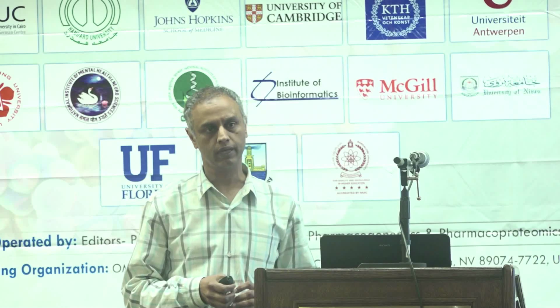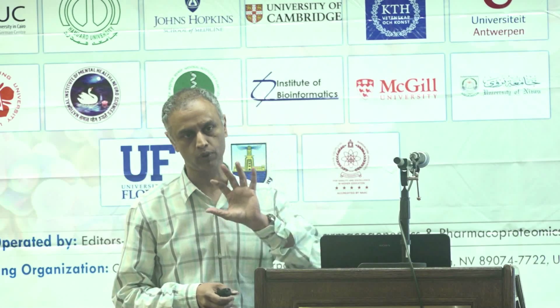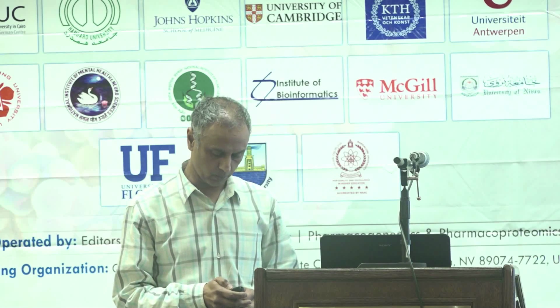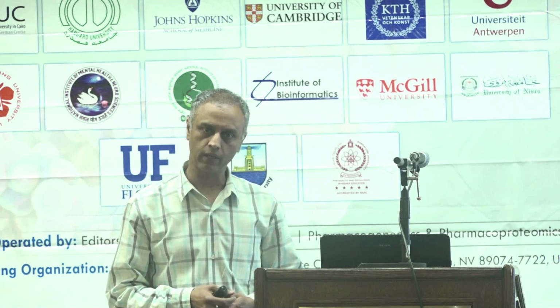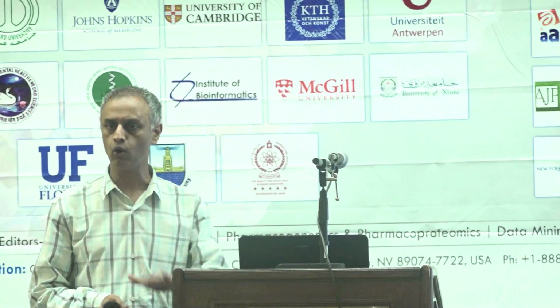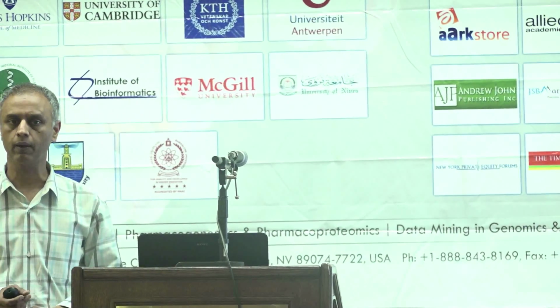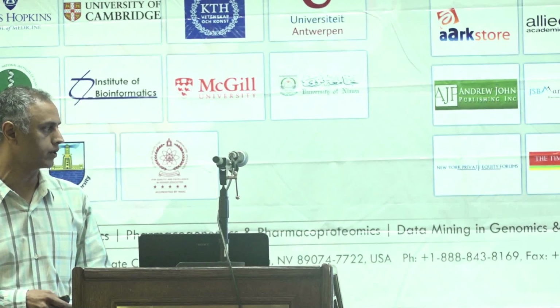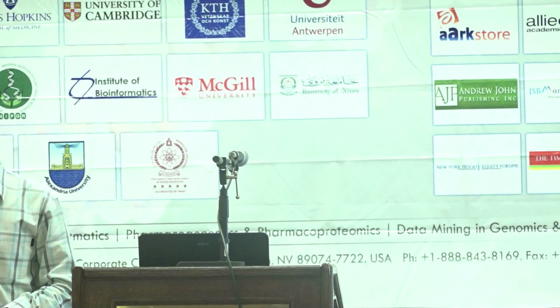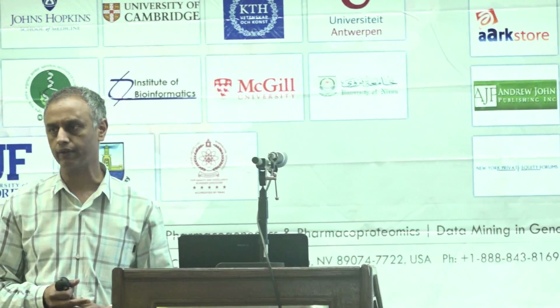Directions that our lab is taking in terms of clinical proteomics. We want to really use these proteomic technologies to try to move it into a clinical setting. And I think one of the easiest, most applicable settings, which is a very low bar in terms of clinical applicability, is actually microbiology. And we are a systems biology lab. We not only do proteomics, we are doing genomics and transcriptomics.